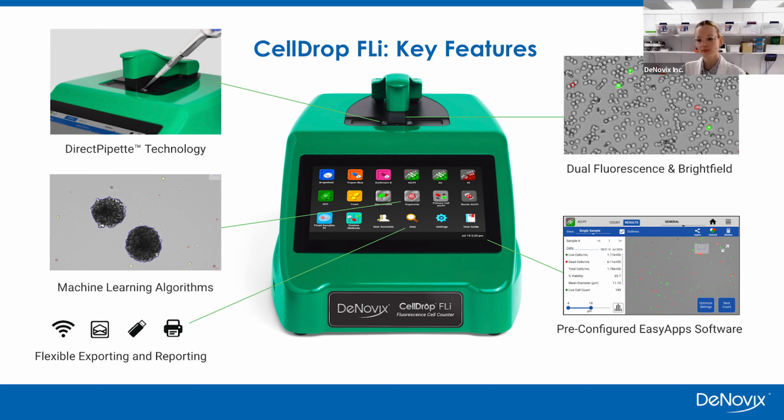So what are organoids? 3D cell culture models mimic in vivo conditions far better than traditional 2D monolayer cell culture. They are normally classified on size, density, and cell type, but a bit of a disclaimer is that the requirements for the classification of these groups may differ from lab to lab. The take-home message is that we can accommodate these and related structures as long as they're within that 4 to 400 micron dynamic range.